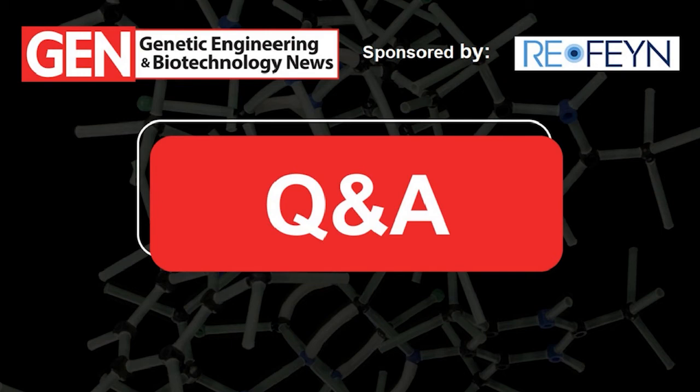All righty, thank you for that. Next question we have is, which kind of purification of AAV productions have you tested? Was it crude lysate? Was it iodixanol purified column? So with the development partners that we've shown the data from, I cannot tell you because they haven't disclosed that. I can tell you that the samples that they used for the comparison with AUC and TEM, they were purified in the identical way. So they used identical purified AAVs for all three different methods.